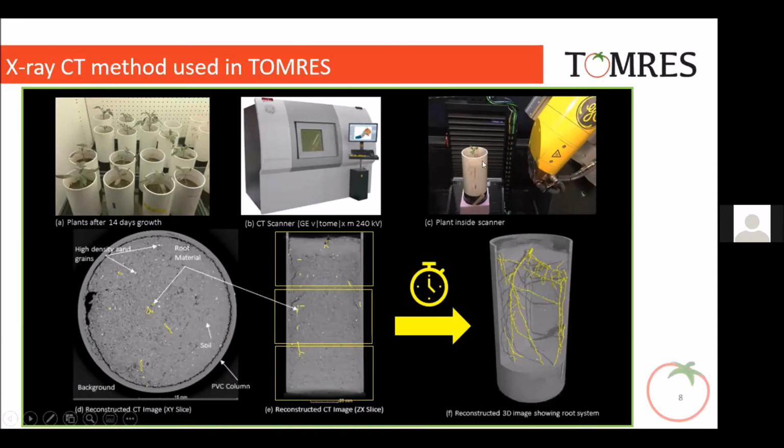In this particular experiment, we're imaging in 3 individual sections. So there's probably a total of about 6,000 images that are taken. And then the computer software reconstructs all this, back projecting a 3-dimensional volumetric data set. So this is one cross-section image through that pot. You use the software and slice through it, and this is going in from the front-hand side.